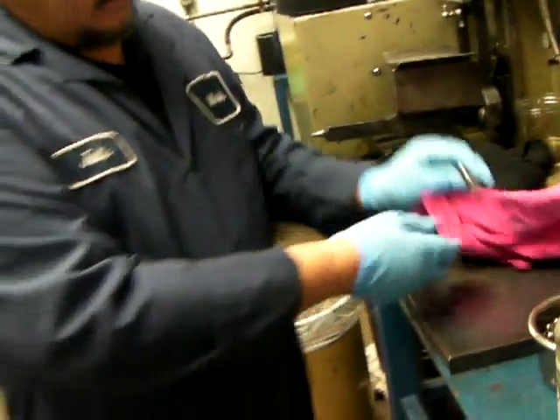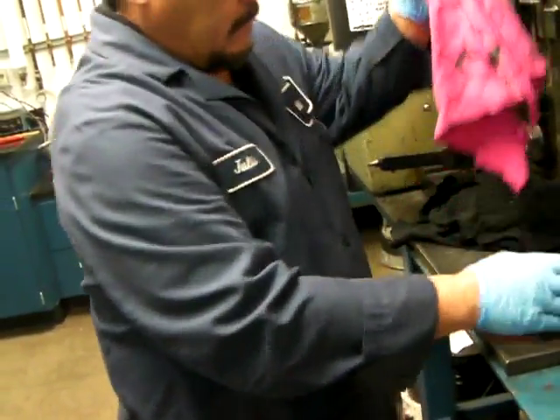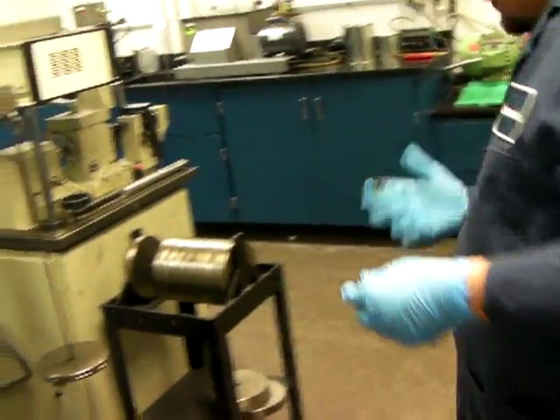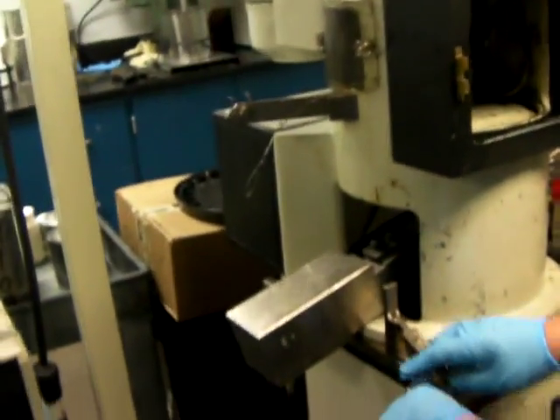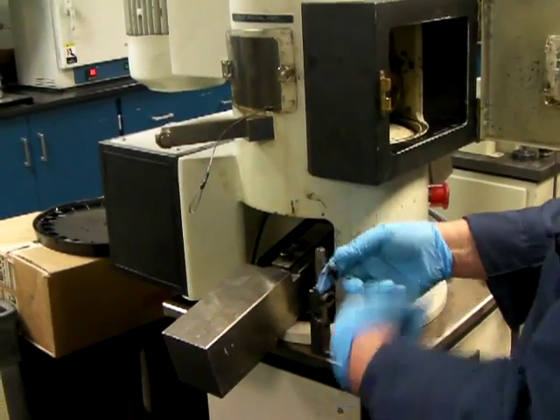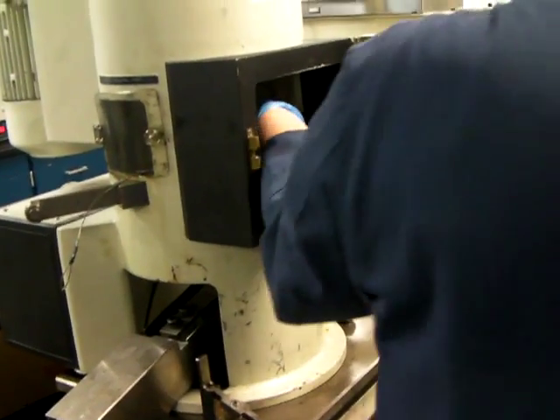Whether you're running the four ball wear or the four ball weld, all of this part is the same. The difference comes in the machine settings — the load, the speed, and the duration. Firmly clamping that ball into the chuck.